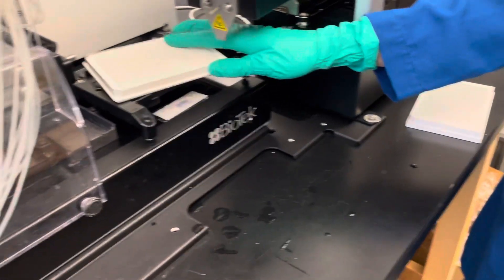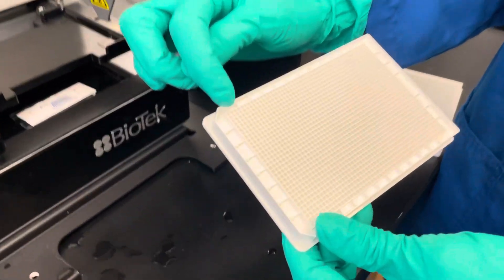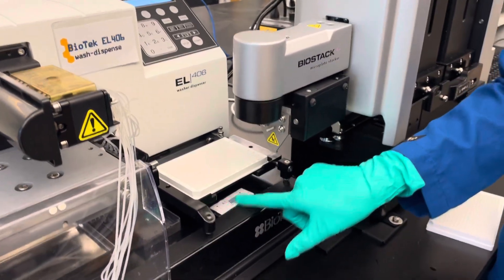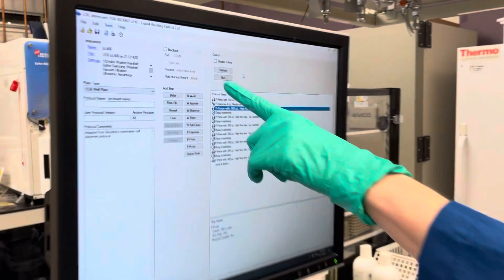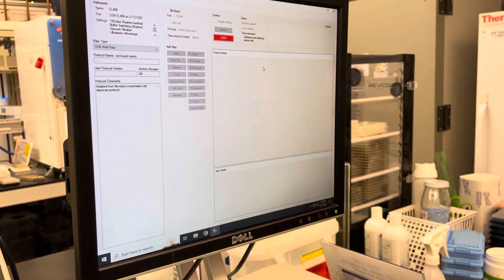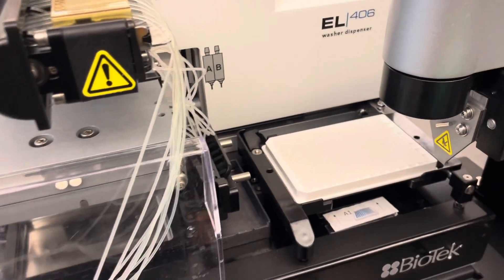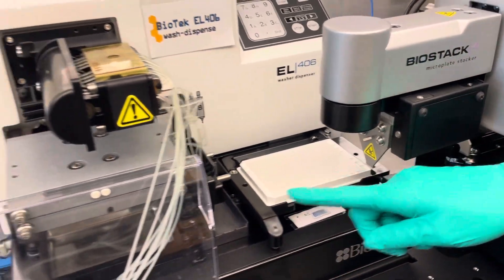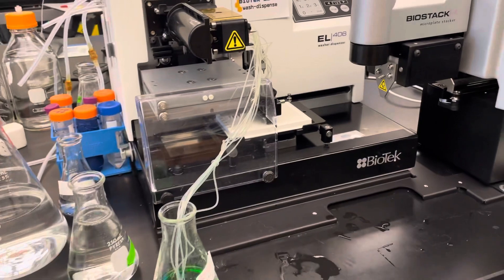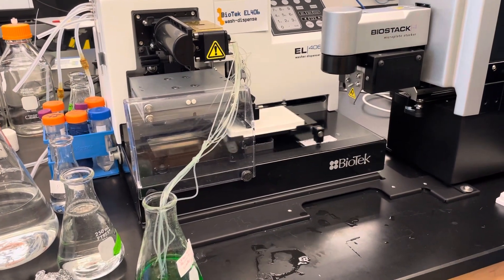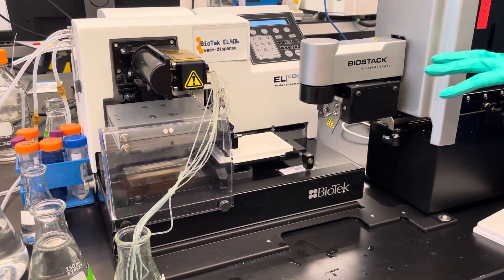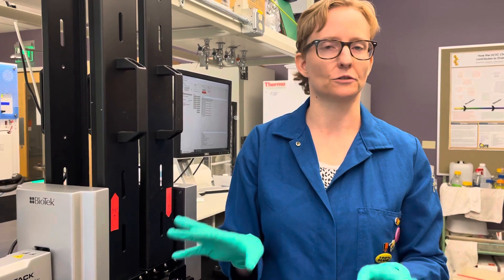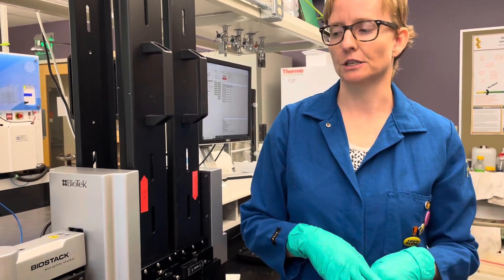Put your sample plate here in the holder. Make sure that A1, the top left corner of the plate, is going to be in the top left corner of the holder — there's a little reminder sticker here. Now we're ready. The protocol is ready. All you have to do is click Run. The protocol starts with a prime. You can see the green liquid going through. That's the pre-dispense. And now it's dispensing four microliters into each well. This is where you see how each tube goes to four different rows — so you could be dispensing eight different cell types, stains, media compositions, or whatever it is you want to dispense.